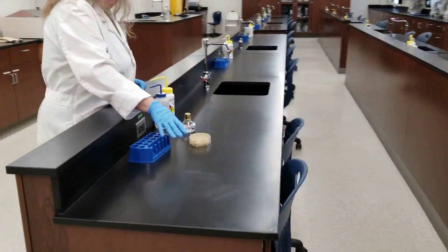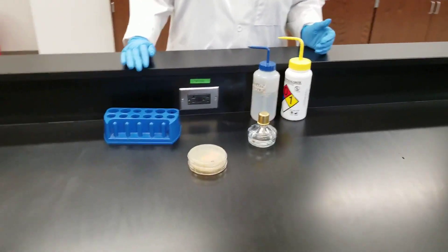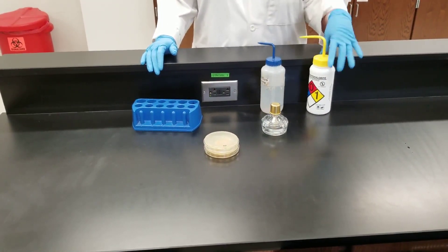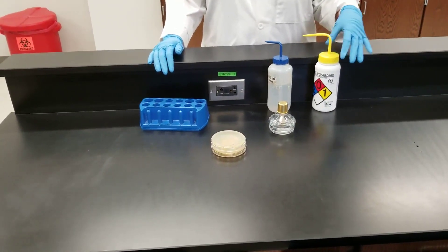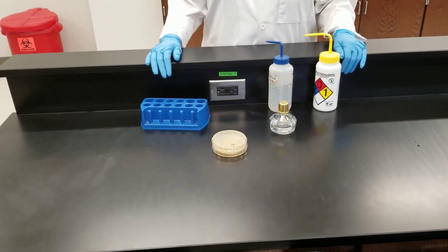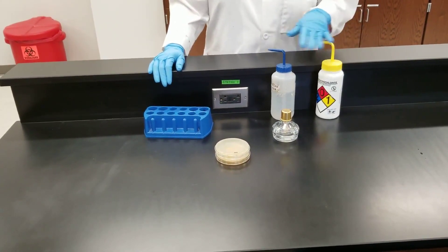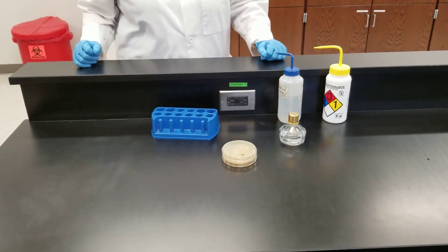You'll put your supplies out, whatever you need. When you are done for the day, you will remove the items. In this lab, we tend to have two bottles — one with distilled water and one that has diluted bleach. When you are done for the day, you will use the bleach to spray down your working area and wipe it clean. The idea is to disinfect it at the end of the day before you leave. So just keep those bottles straight and keep that work area as clean as possible.